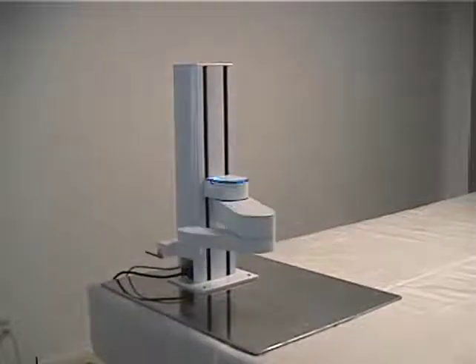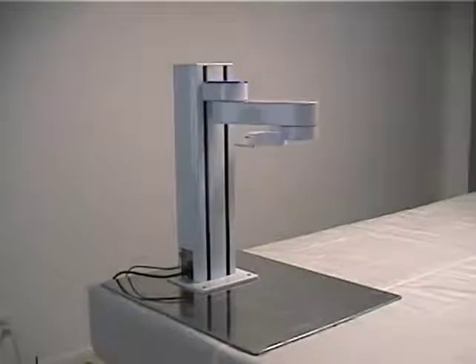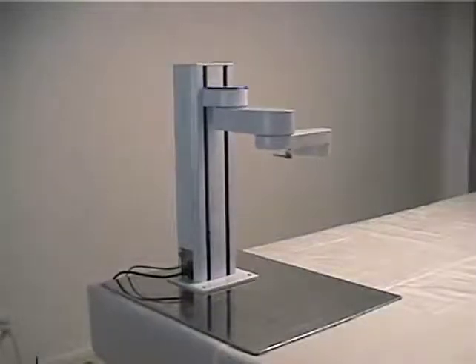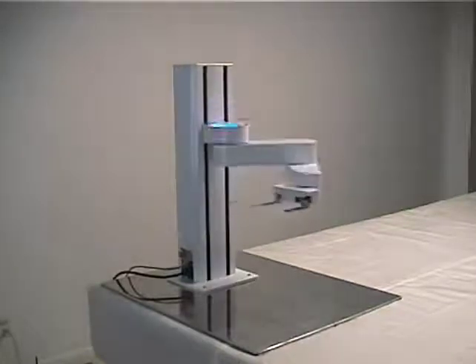The PF400 is an automation solution for laboratories and an ideal solution for any application characterized by limited floor space or high safety requirements, such as mechanical assembly or parts handling.